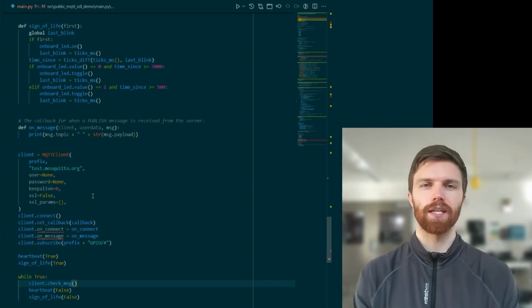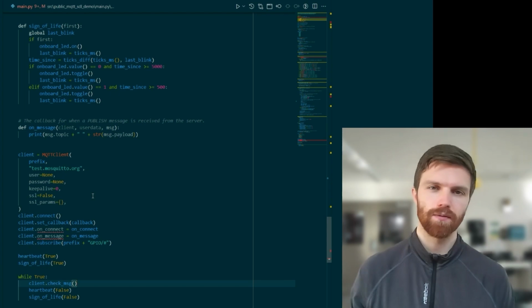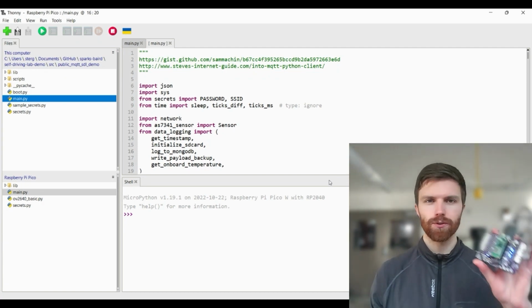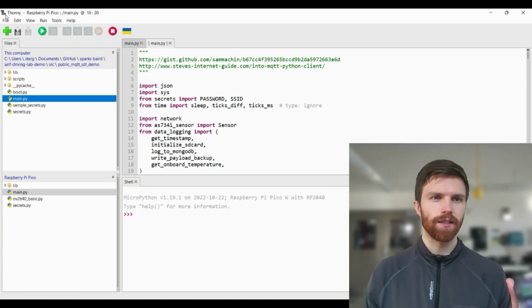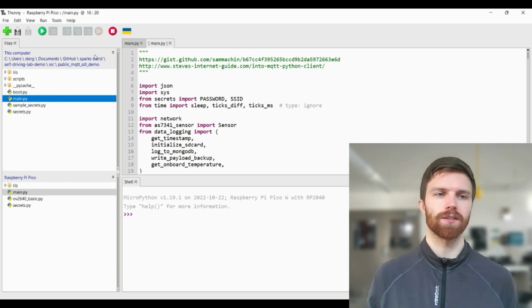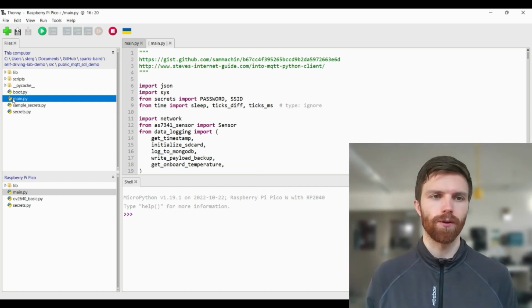It will read the sensor data and then sort of reset the experiment and send the relevant data back. So once we have our code ready, we'll upload it to the microcontroller connected via USB here. And in the Thonny application, which just makes it easy to upload code to microcontrollers like the Pico Wireless and other Arduino microcontrollers, Raspberry Pi controllers, and so forth.